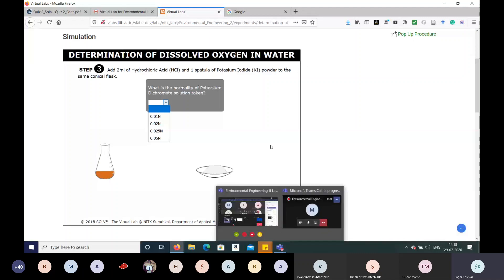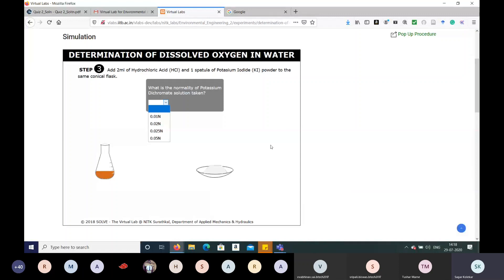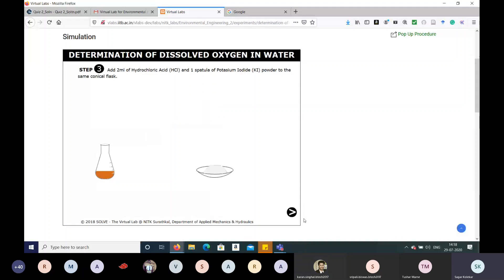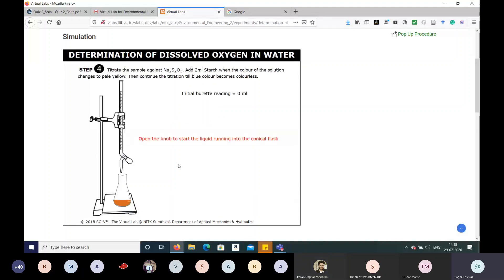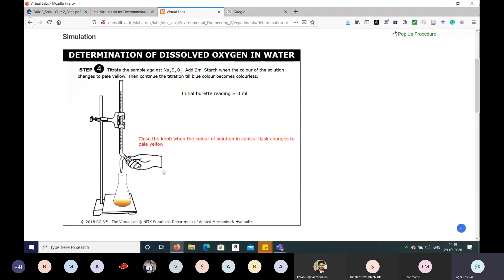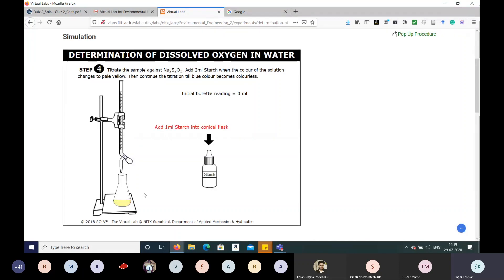The normality of potassium dichromate taken is 0.025 — that is the correct answer. Now titrate the sample against sodium thiosulfate. Add 2 mL of starch when the color of the solution changes to pale yellow, then continue the titration until the blue color becomes colorless. Start the titration and observe the color changing to pale yellow, then close the knob.